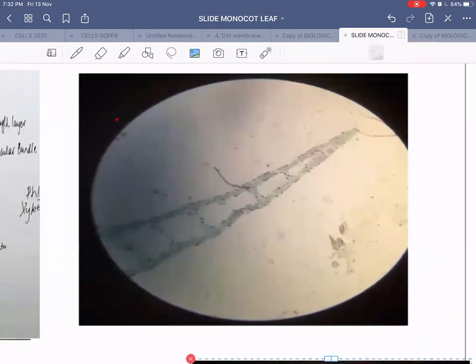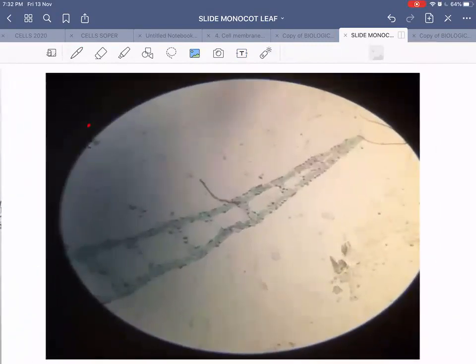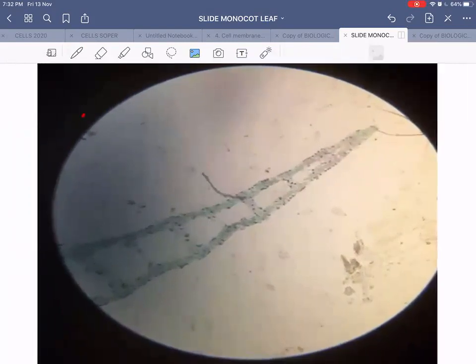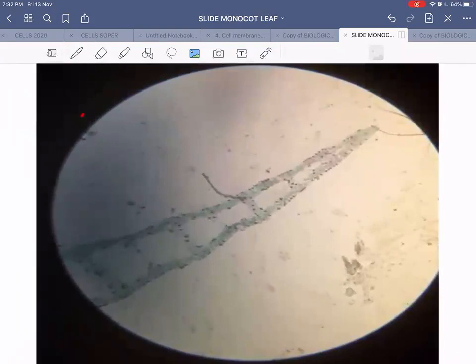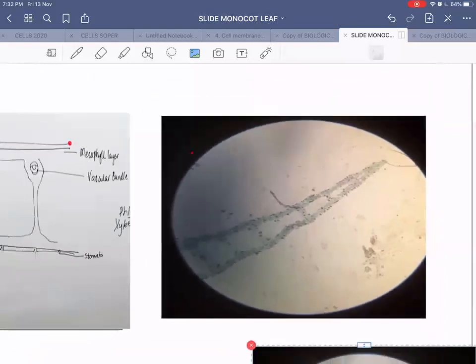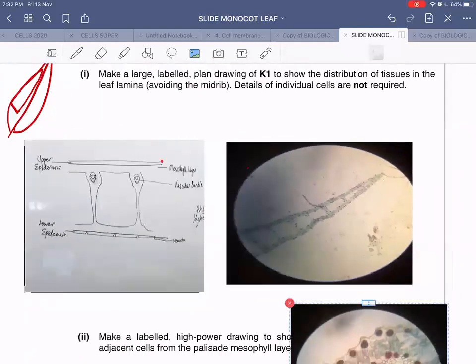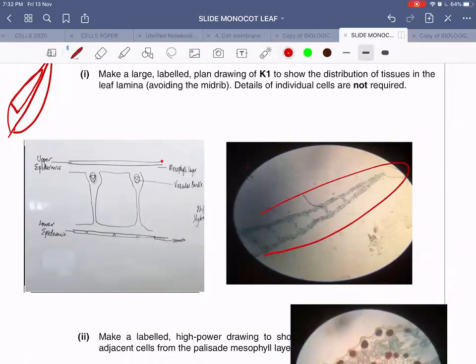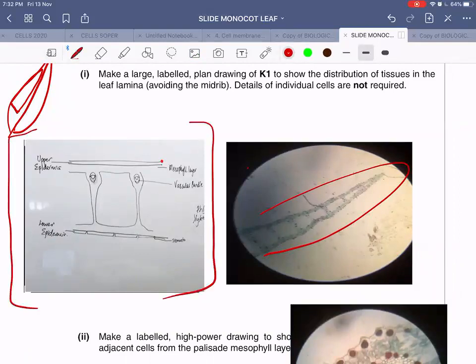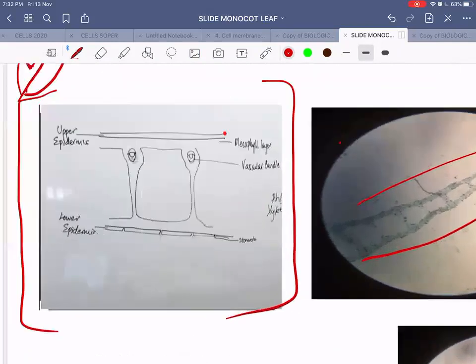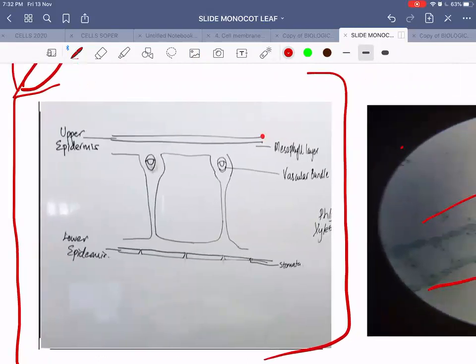This is how your slide will look like, and this is how you're supposed to draw the large labeled low power plan diagram. If you make a plan diagram of this slide it should look like the drawing on the left. You have the upper epidermis at the top, then the lower epidermis, and the palisade layer visible in between.